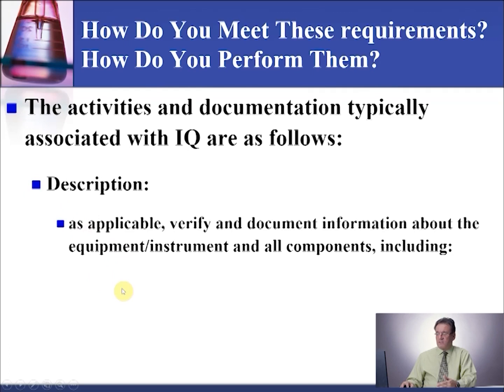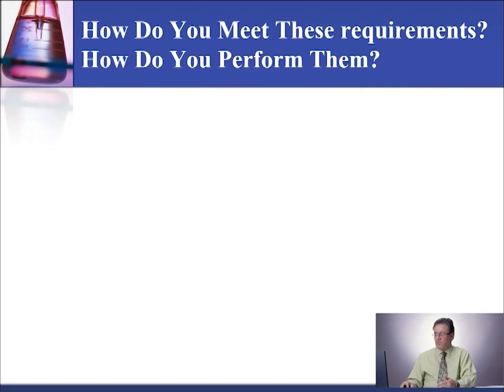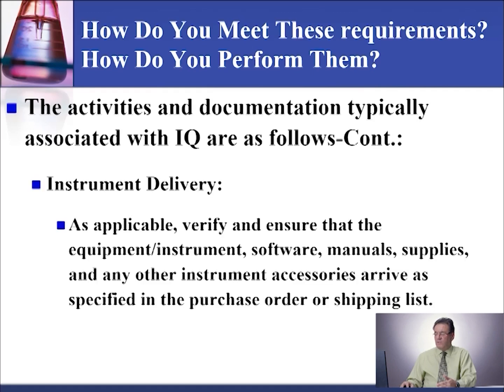Also, as applicable and needed, the manufacturer recommendations, your laboratory policy and procedures, the accreditation body standards, and or good laboratory practice need to be followed when you are doing the verification or performance verification for the equipment or the instrument.